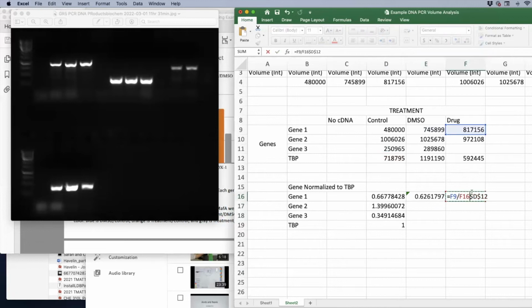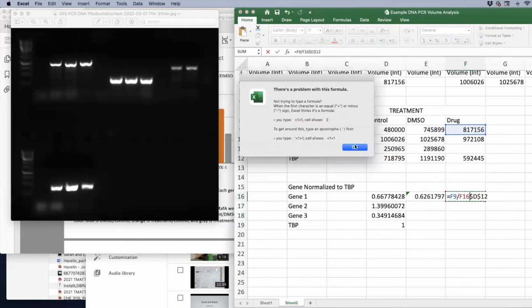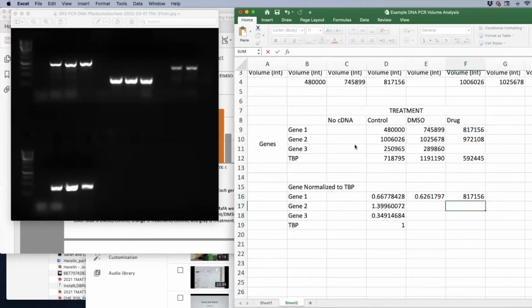This one's still over. Oh God. Edit undo. Okay, I just messed it up, but I did edit undo and it's better. So this one is over here. Cell's still locked, so I'm dragging it over. Enter. Right. So now I have those two set up. I can select both like that, drag both down, and ta-da, it did all that math for me automatically. Any questions? Nope. Okay.